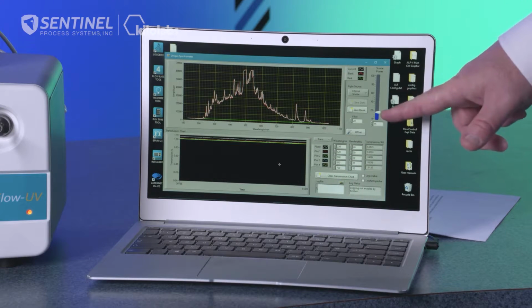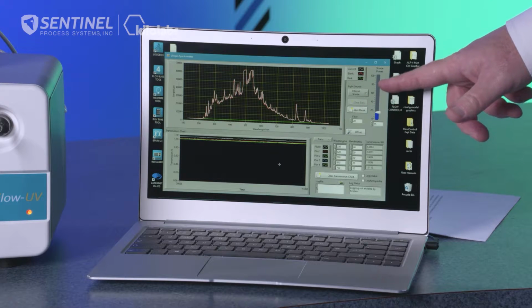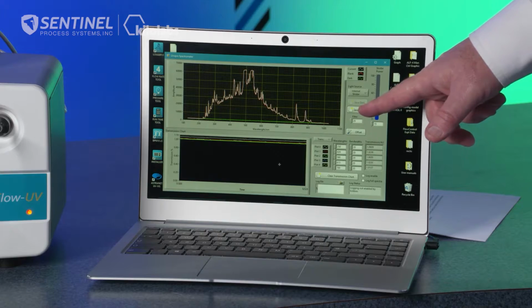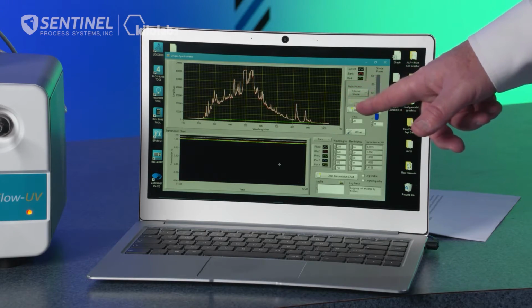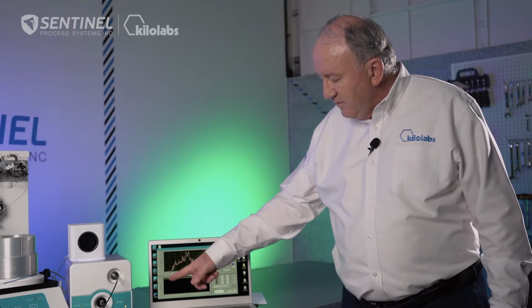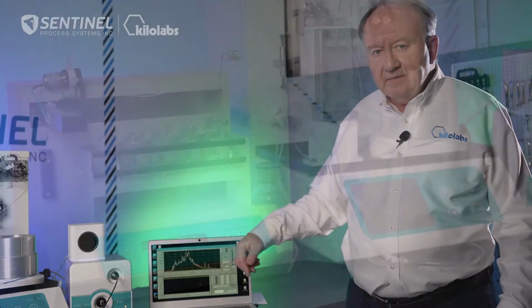Up here is a strobe intensity light, so you can change that from 0 to 100%. This is a relatively benign solvent, so we have it set down at 15%. Finally, there's a Save Blank button, and what this allows you to do is save the blank spectrum so that the deflection from 100% transmission is measured against the blank.